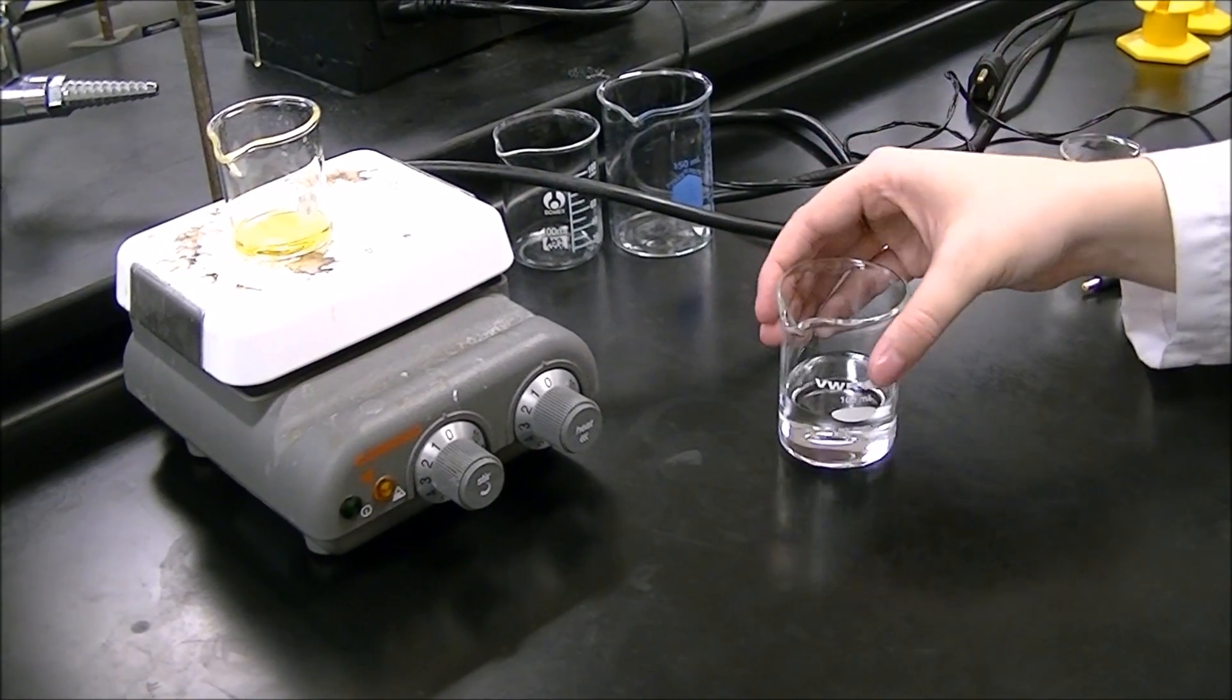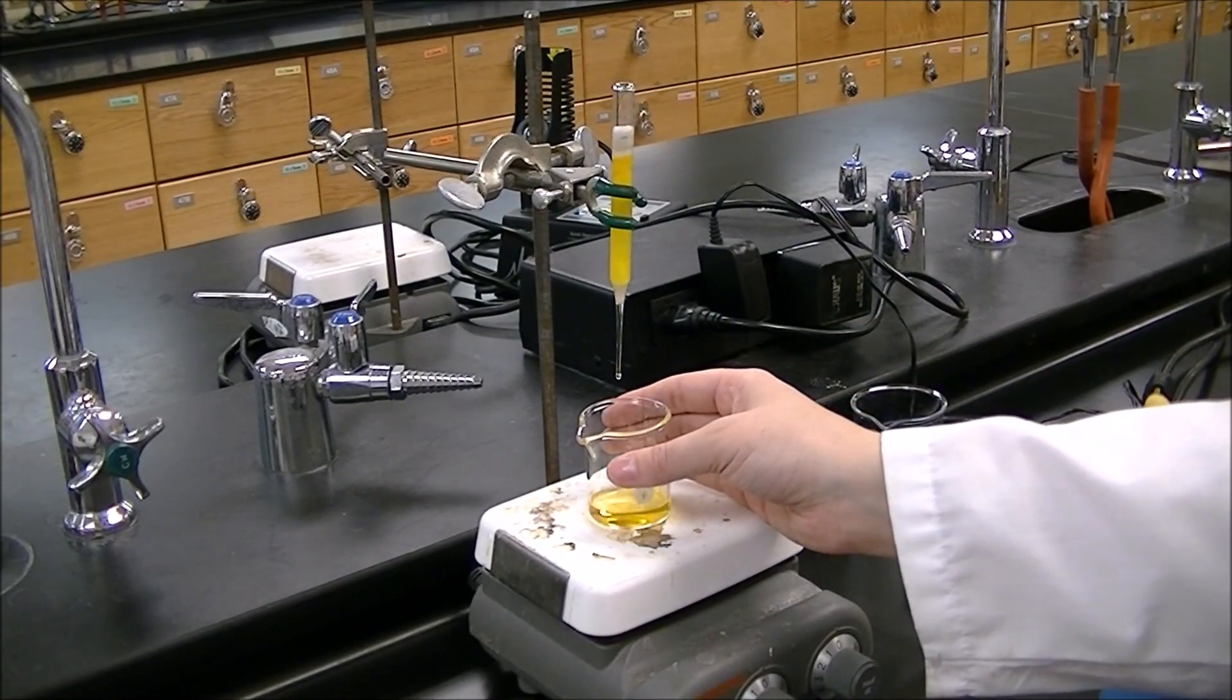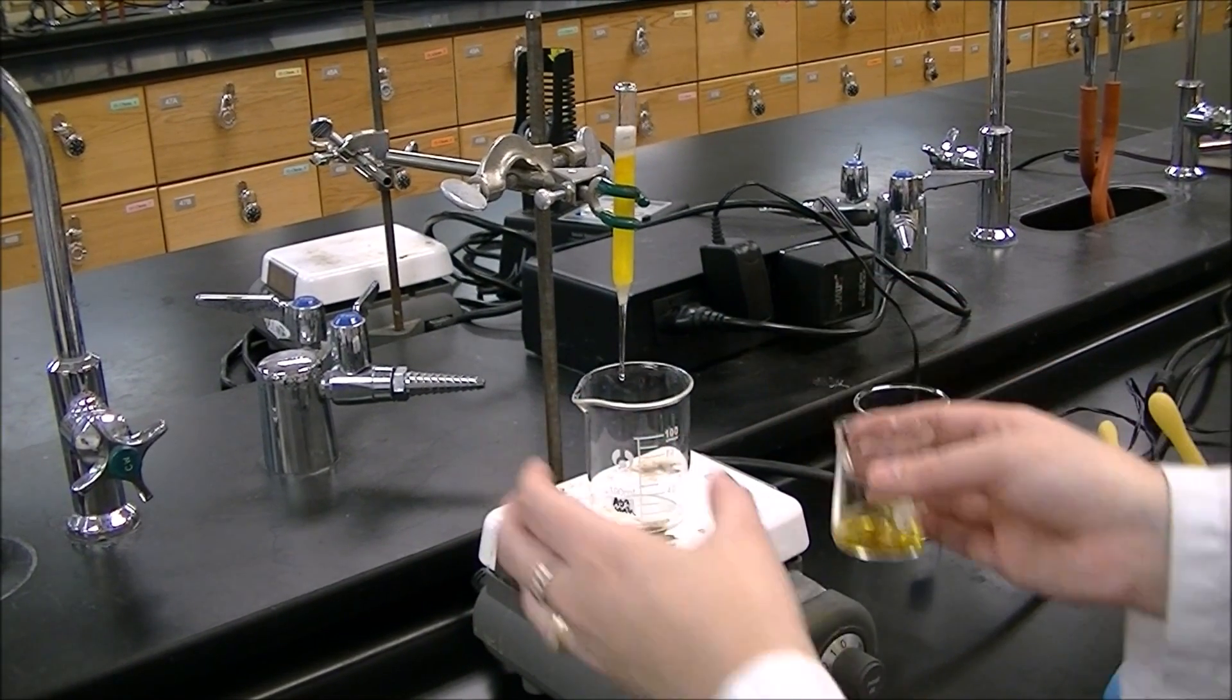You need to remember to regularly mix your eluent. Once you feel you've collected enough trans isomer, switch collection beakers.